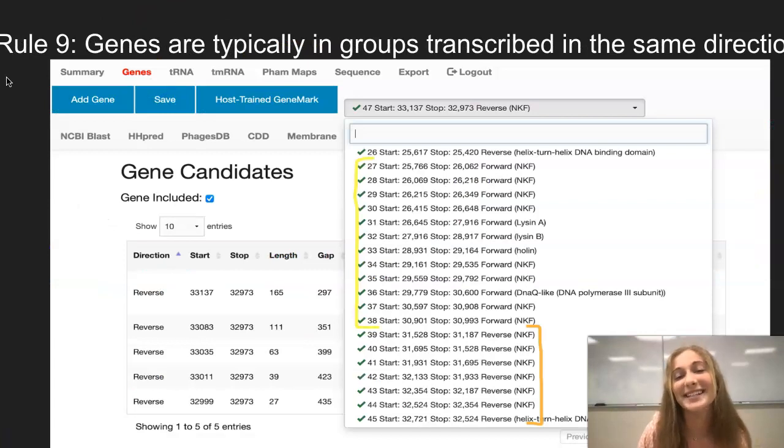Rule number 9 says that genes are typically grouped in the way that they are transcribed. On pecan, we can see how genes 27 through 38 are all in the forward direction. And then genes 39 through 45 are all in the reverse direction. It is very common to see genes grouped together like this. It is less common to see them switching from forward to reverse constantly.